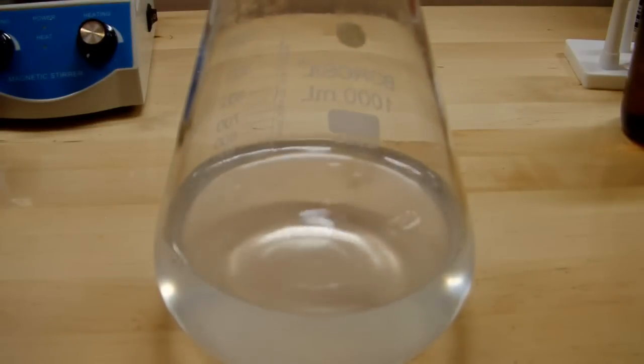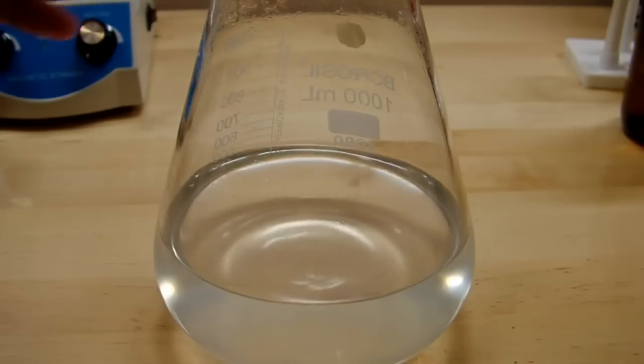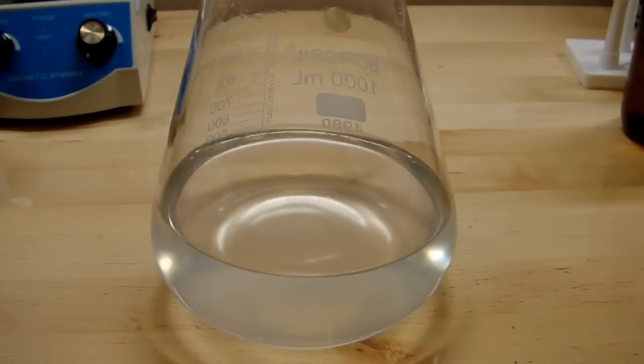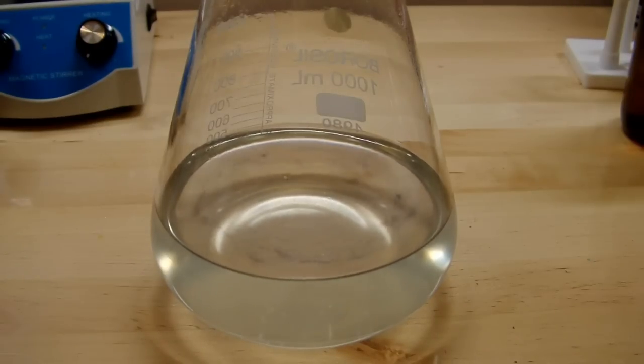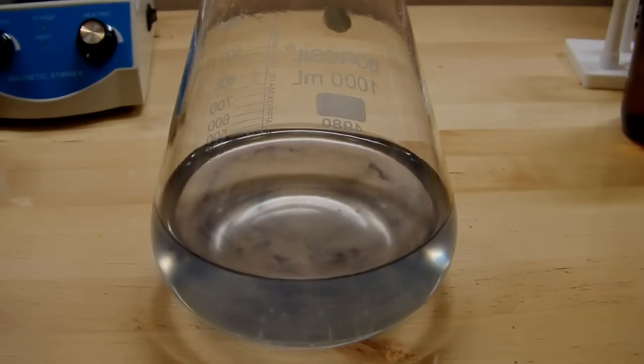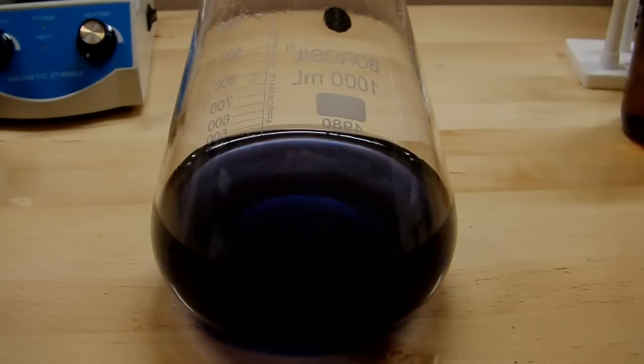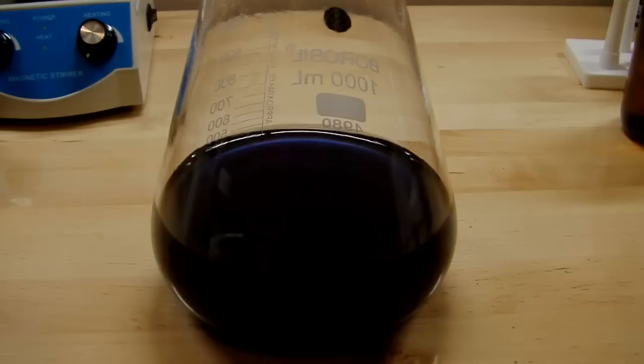But this is where it starts to get frustrating also. Because once it clears up, if you leave it alone, it tends to go right back to blue. Now you can see the colors start to condense. The iodine slowly complexes back with the starch to form that blue color again. So I just got to keep adding thiosulfate until it remains clear.